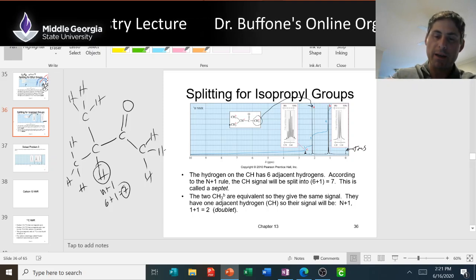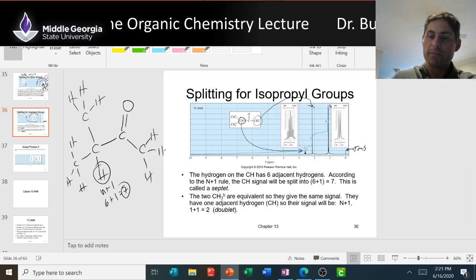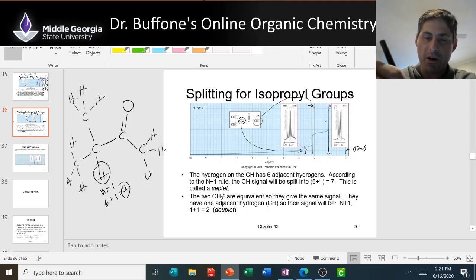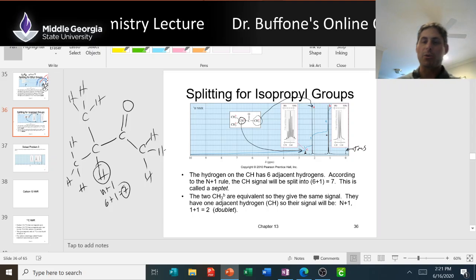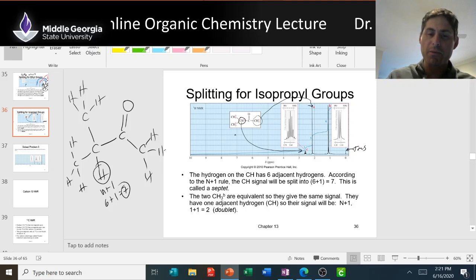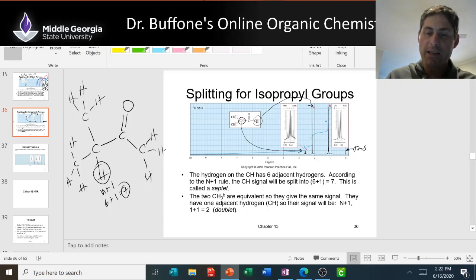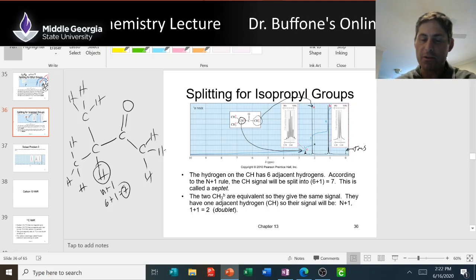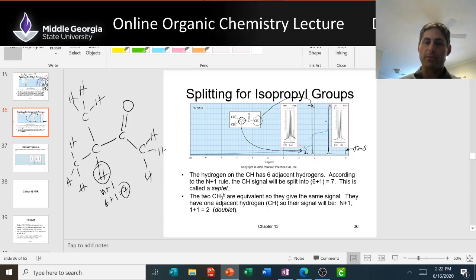And then you have these 2 methyls that would be a doublet. And they're almost normal. A methyl should be 0.9, but this is a methyl on a carbon that's next to a carbonyl, so I'm thinking a little above 1, 1.2, 1.1. It's a doublet near 1. It looks to be at 1.1, so this makes sense, right? The methyls are the most shielded because they are furthest away from the group that de-shields things, the carbonyl. The CH and the CH3 that are directly attached to the carbonyl are de-shielded, right? They're shifted downfield to 2 and whatever this is, 2.5, 2.6 something, which makes sense.